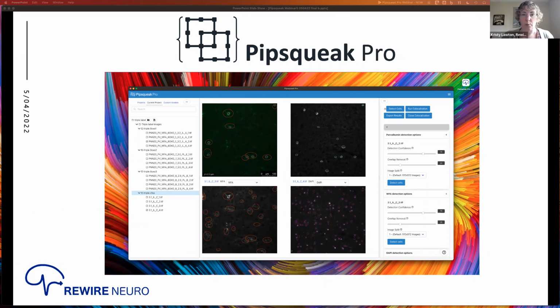Okay, I'm going to switch to the next poll here. So we'd love to hear a little bit more about what kind of analysis you're doing and what kind of analysis might interest you in the future. So if we could just fill this out real quick, would be really helpful.